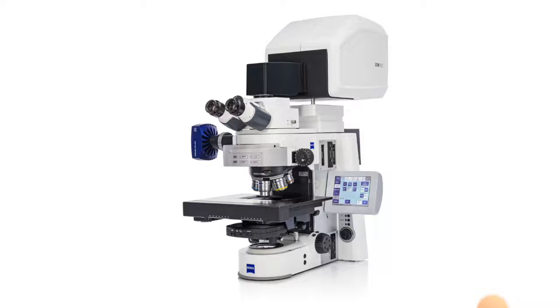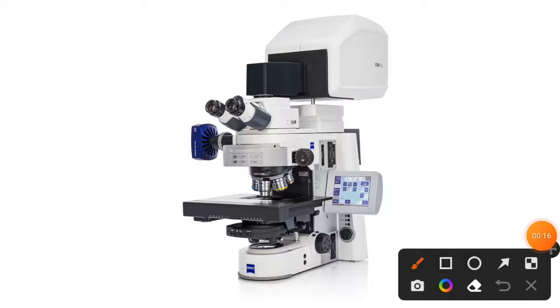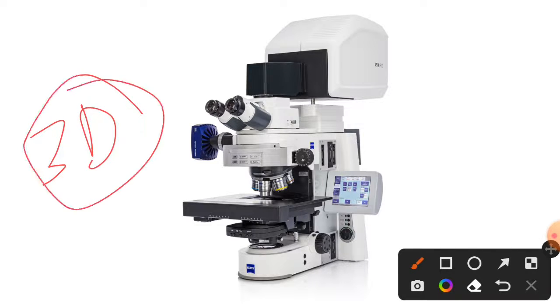In the previous video lecture we discussed fluorescence microscopy, right? In that lecture I did not mention a problem associated with fluorescence microscopy, and not only fluorescence microscopy but each and every microscopic technique that we have discussed until now: those techniques cannot produce any kind of 3D image.